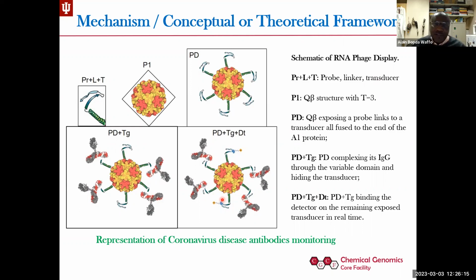We can all do this in the core. We can have sensing of some specific protein using the phage. We just need to have the appropriate transducer. We have nanoparticles that help. We are thinking of FRET, how energy can be transferred when you are in close contact, and you have signal. We are thinking of all those. So we'll come up with some mechanistic way of presenting small molecules where you can use even your cell phone out there to monitor some of the molecules.